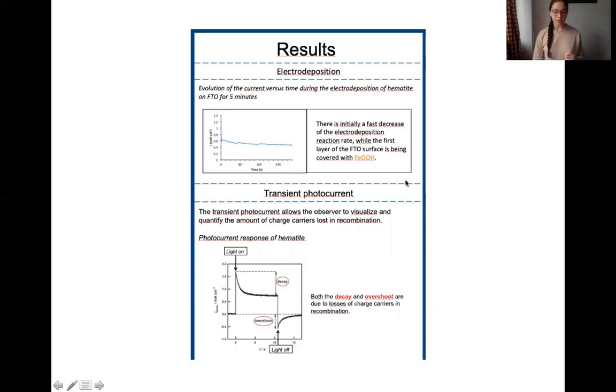About the analysis, a transient photocurrent is a super interesting measurement to do because it allows us to visualize and quantify the amount of charges that are lost in recombination. Here we see a typical response, a photocurrent response of hematite.